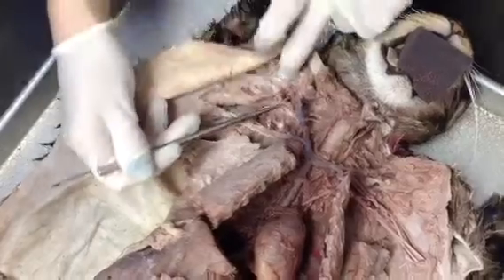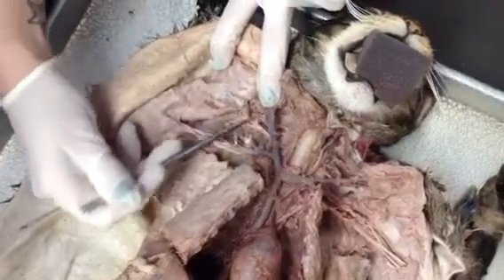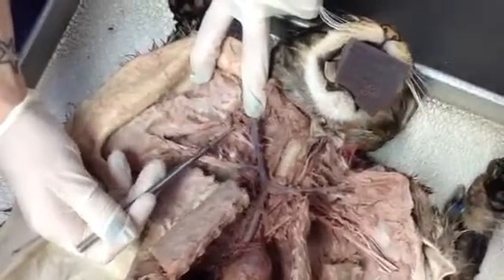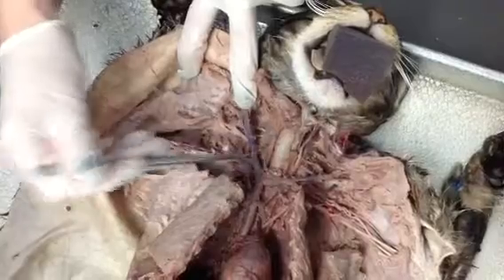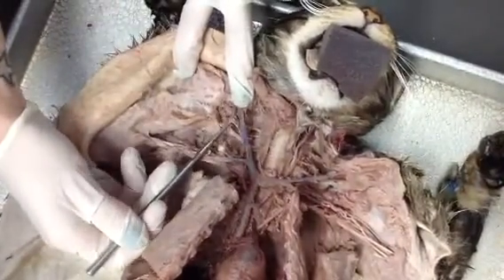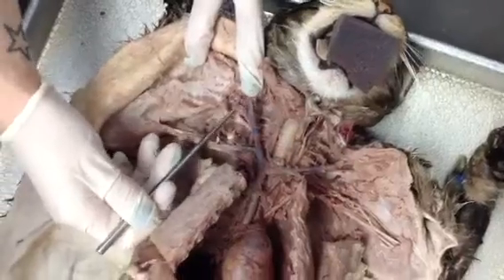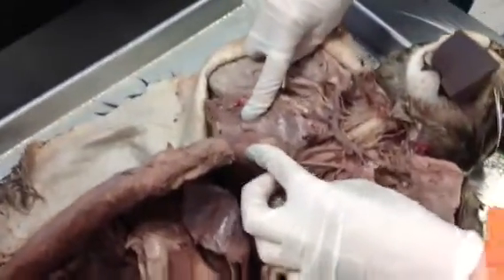here you can hopefully see this blue guy here, okay? And that's the transverse scapular vein. Okay, so brachiocephalic, jugular, subclavian, and here all the way on top, it's transverse scapular. All right? Okay, with the arteries, hope everybody can see that here.